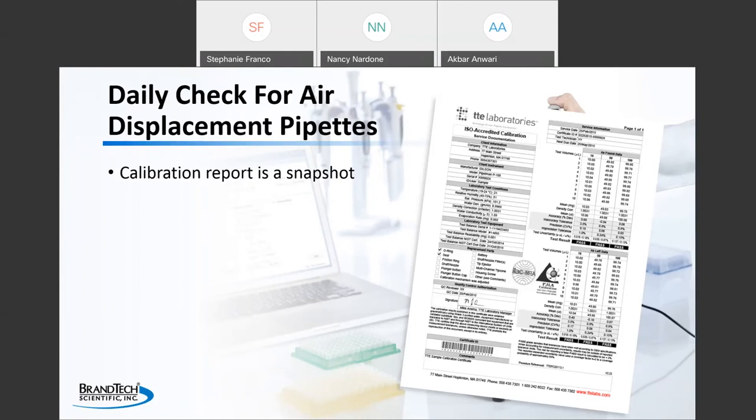When sending an instrument to a calibration facility to have the testing done, it's possible to request, in addition to the final calibration certificate, an as-found report. The as-found report will detail the condition of the instrument when it arrived at the facility. Sometimes the as-found report will show that the instrument was not within specifications when it was received. And for some labs, this can be a real problem, especially with pipettes, because now all of the data that was produced with that instrument since the last calibration is questionable. All of the work that was done with that instrument in that time period now has to be repeated at a significant cost in time and money.